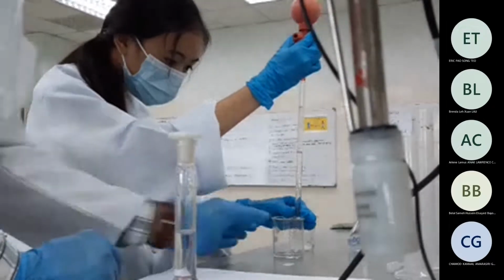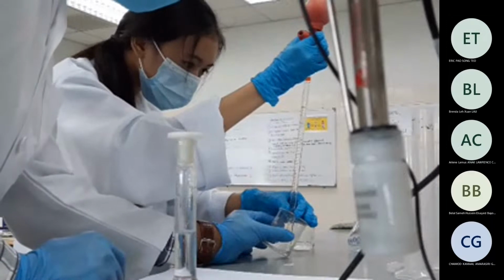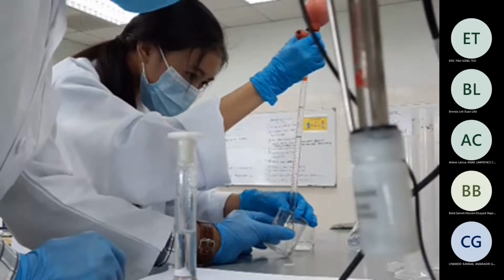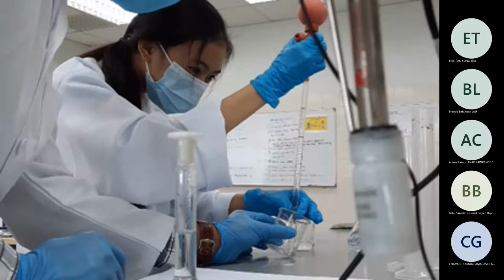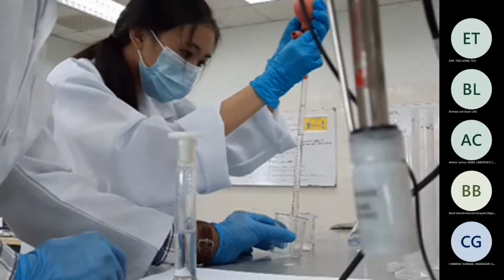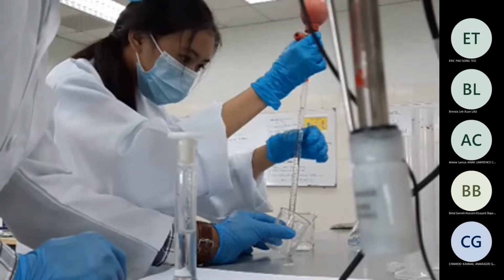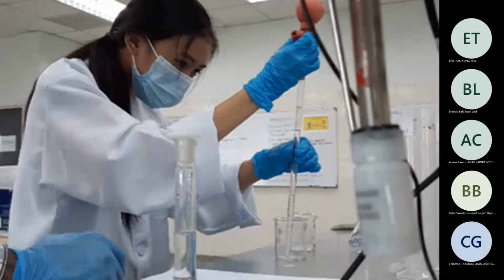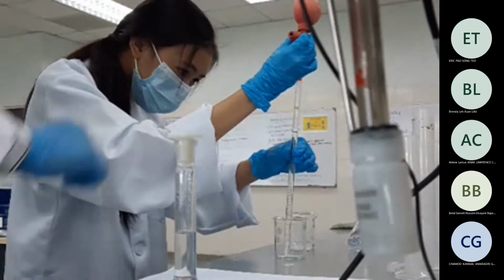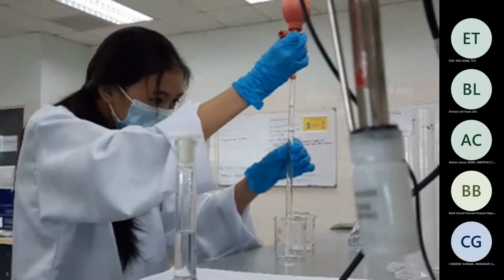The bubbles are coming because you don't have enough, so you can tilt a bit and then take from here. Yeah, so try to reduce it. You have to keep your eyes at the level, not tilt your head, like that.